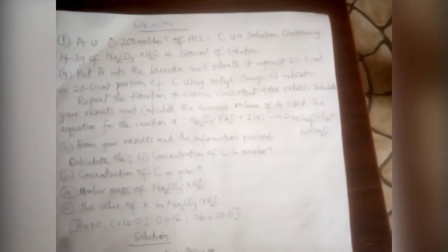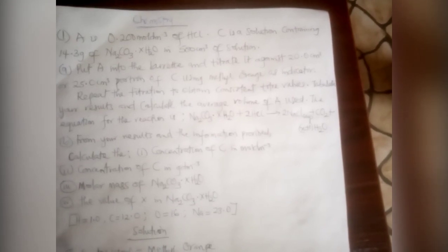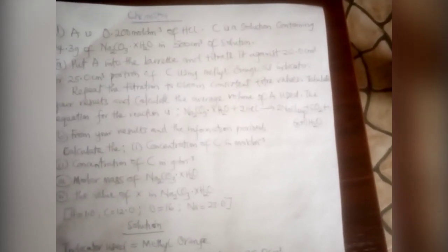A is 0.200 mole per dm cube HCl. C is a solution containing 14.3 gram of Na2CO3.xH2O in 500 cm cube of solution. Put A into the burette and titrate it against a 20.0 cm cube or 25.0 cm cube portion of C using methyl orange as indicator. Repeat the titration to obtain consistent titer values. Tabulate your result and calculate the average volume of A used.